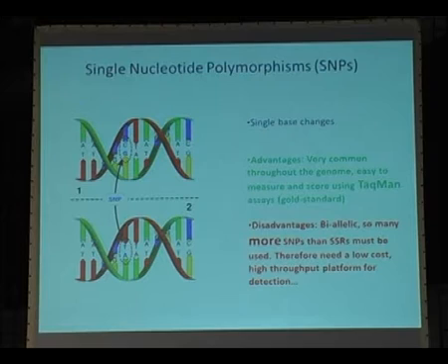As a result, people have switched to the use of single nucleotide polymorphisms as markers. The advantage of SNPs is that they're very easy to score and very amenable to high throughput screening. Furthermore, using TaqMan technology, you can achieve very high specificity. However, the downside of SNPs is that they are biallelic. Therefore, you need relatively more SNPs than SSRs to achieve the same level of genetic information.